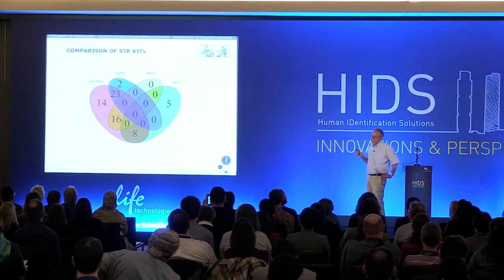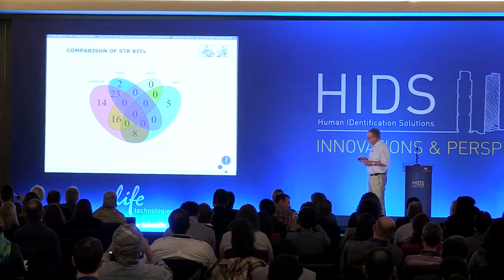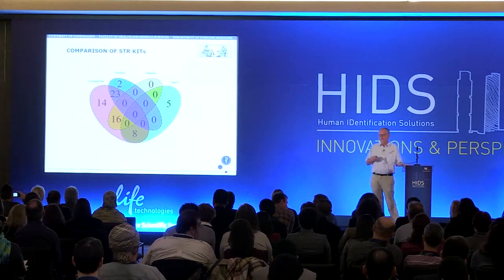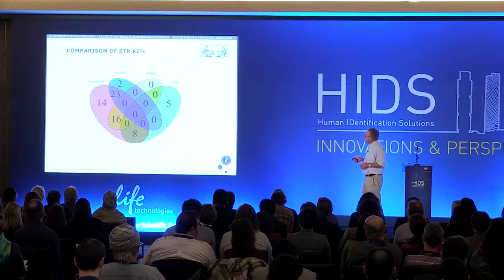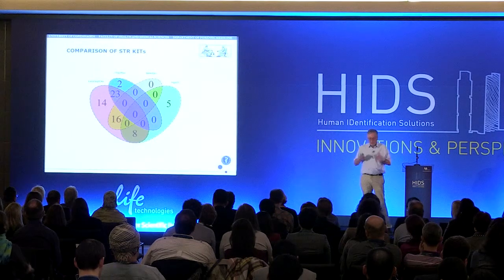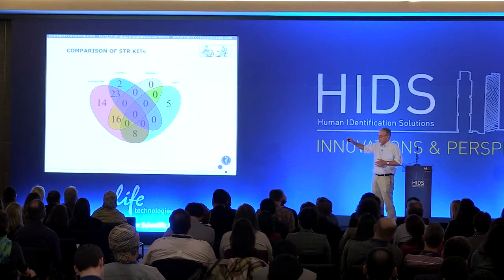We also need to think about which markers are actually being investigated with these various kits, and we need to have comparability to the old stuff that we have in our databases and in our files. And you can see here that this concordance is not complete, but hopefully it will be possible to obtain at least some concordance with these new methods.